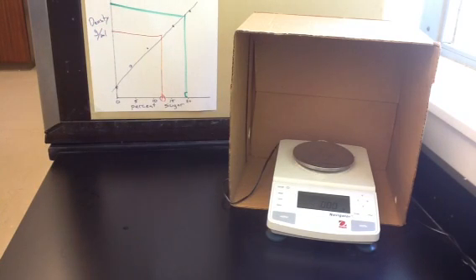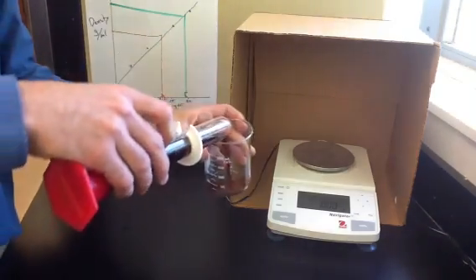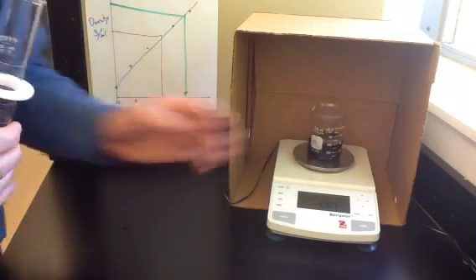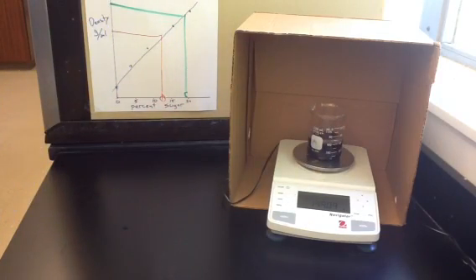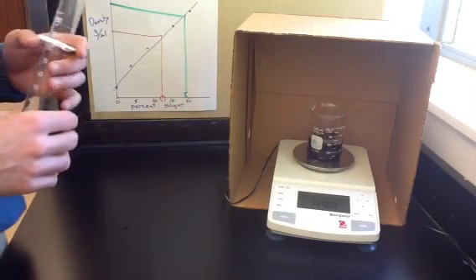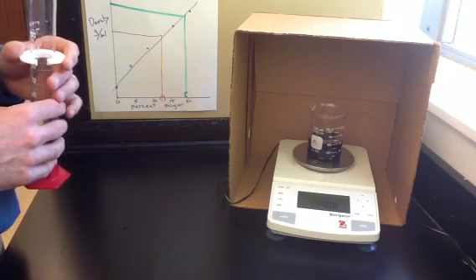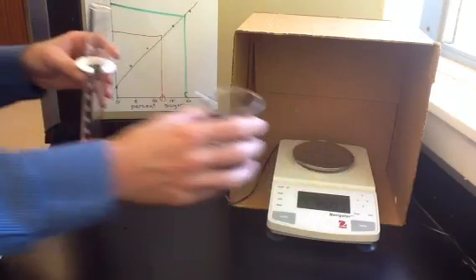And lastly, we have the grape juice. 100 milliliters of grape juice has a mass of 199.08 for the grape juice.